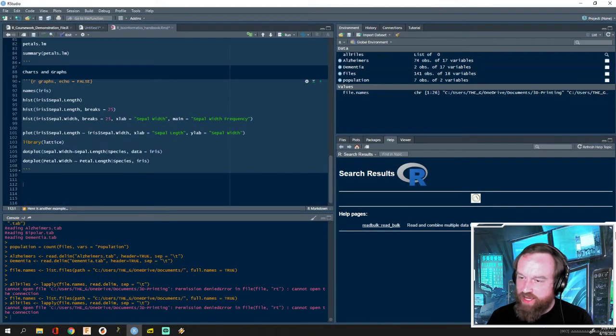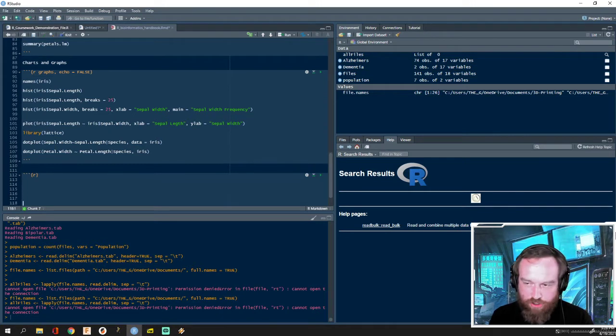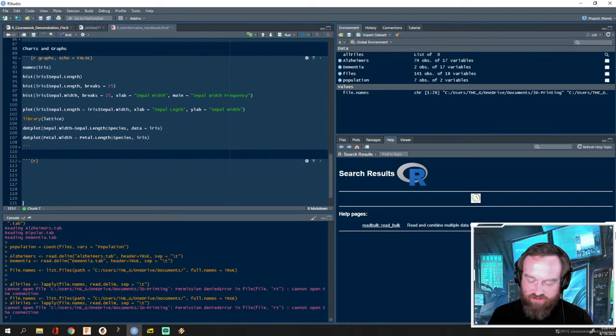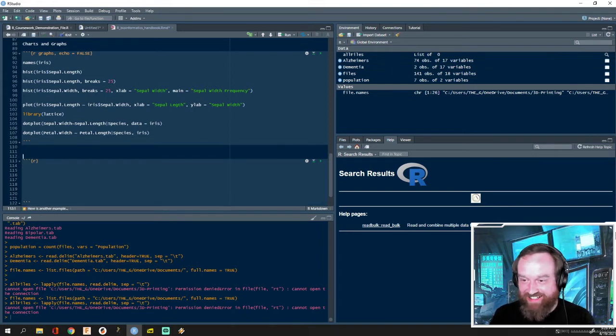Okay, back to R now. So the first thing we're going to do, we're going to use our Markdown file that we've started previously to just keep updating this as we go through the course. And this way you'll build your own textbook. So I encourage you to make sure you annotate it well, even better than I annotate mine. I take shortcuts there. So here we're going to say, example, we are going to learn how to upload our own data.